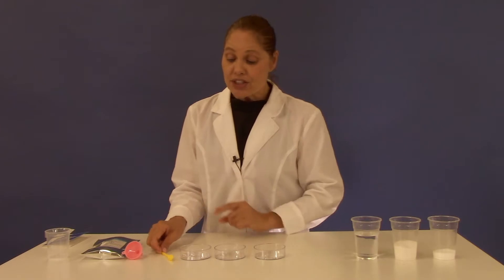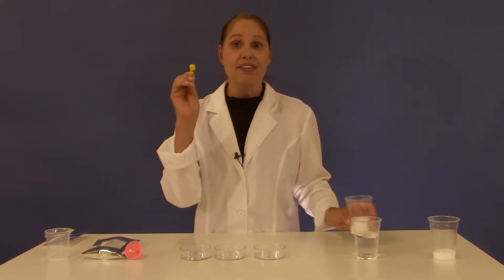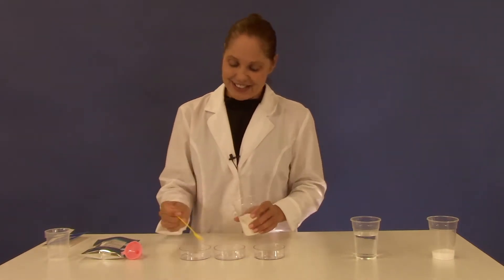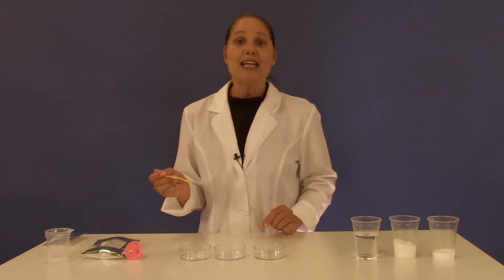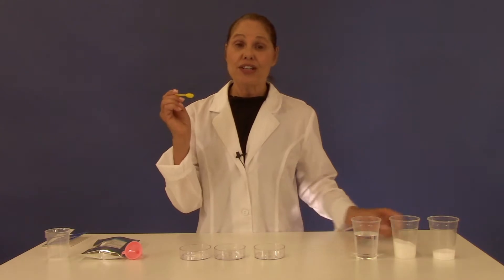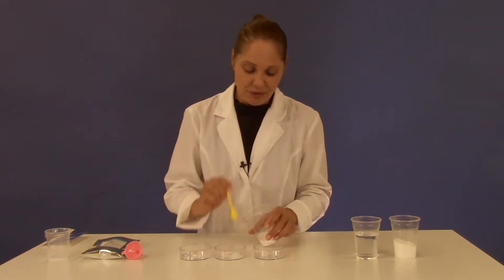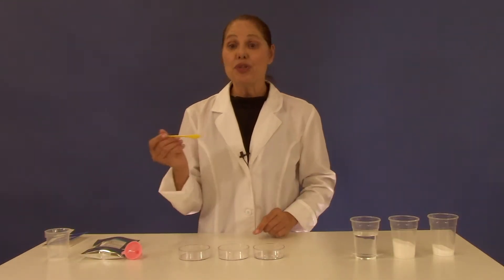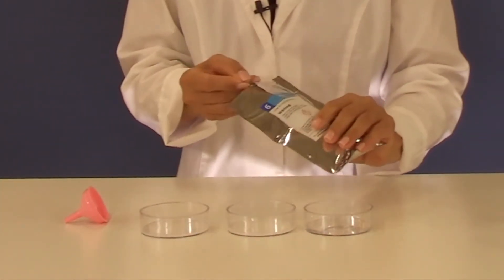Now into petri dish number one you will mix three to five level large spoonfuls of sugar. In petri dish number two you will add three to five large level spoonfuls of salt. And in petri dish number three you will add three to five spoonfuls of urea.